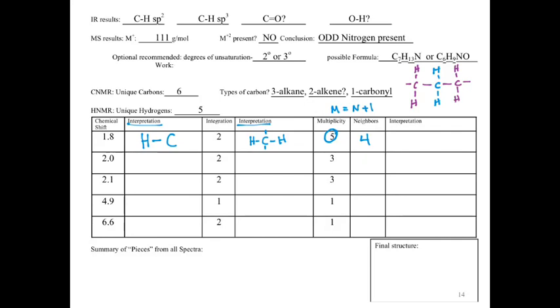So our signal is that one. Again, we can kind of run into an issue on how we want to interpret this. What I'm going to go ahead and do, because I think students seem to like this part a little bit better if we do it this way, is now summarize this piece. So down in our summary of pieces, I would go ahead and include that piece.